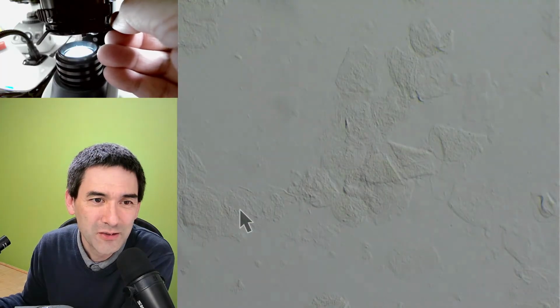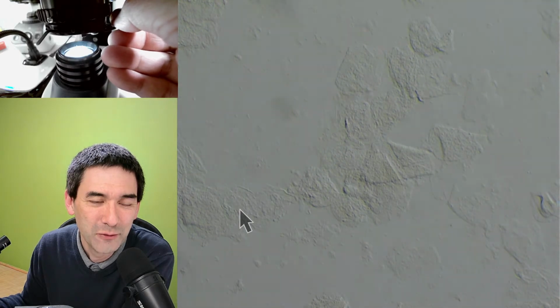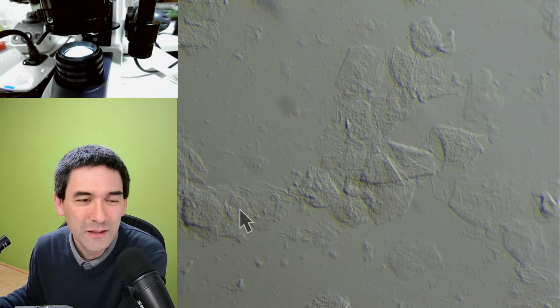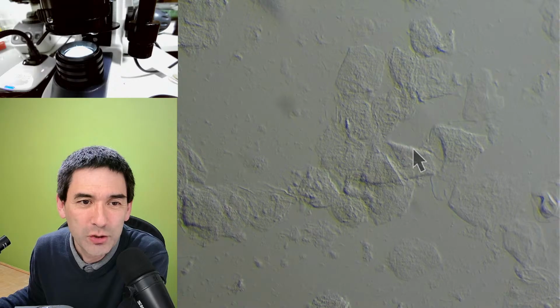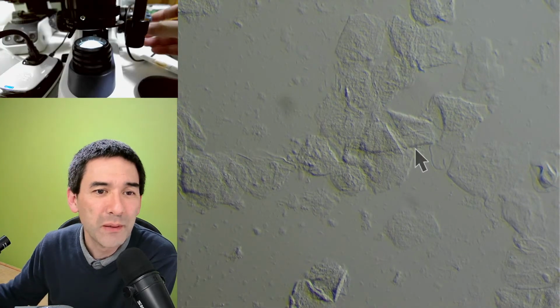Look, I just want to show you something here, something quite subtle, you have to watch carefully. I'm going to use the arrow again. Depending on whether you're using the inside or the outside edge of the filter holder, look at this edge here. At the top now, the edge is bright. The top edge is bright. I'm going to leave the arrow there. Light seems to be coming from the top. Now I bumped it.